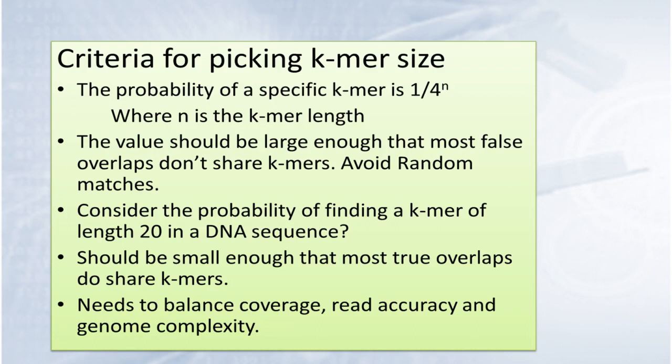A lot of modern algorithms for assembling sequences will actually run through different KMer sizes for you. The program that you're going to use to do your assembly attempts multiple different KMers and then picks an optimal range of KMers for your analysis. And so this is largely taken out of your hands, but it's important to think about it.